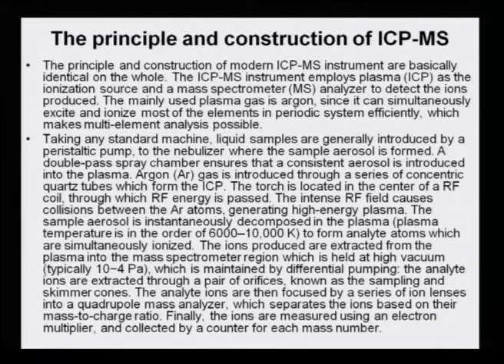It mainly uses argon as the plasma gas, since it can simultaneously excite and ionize most of the elements in the periodic system efficiently, which makes multi-element analysis possible.